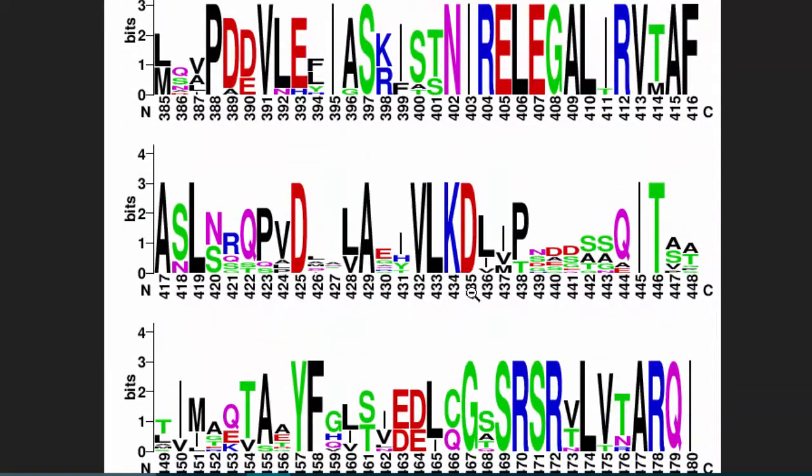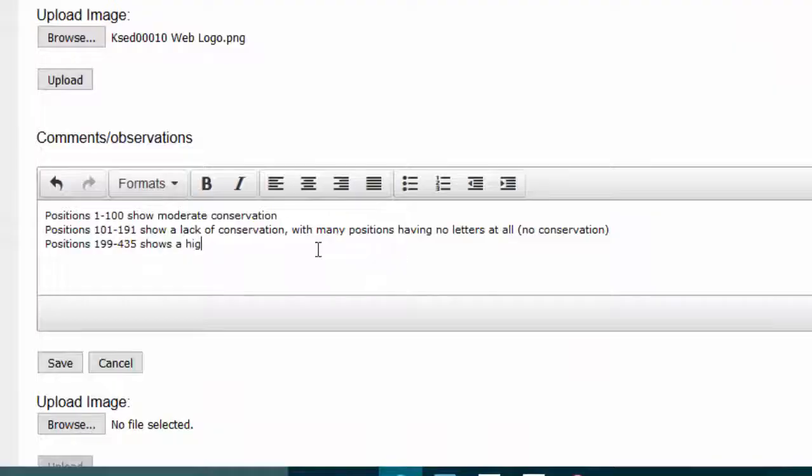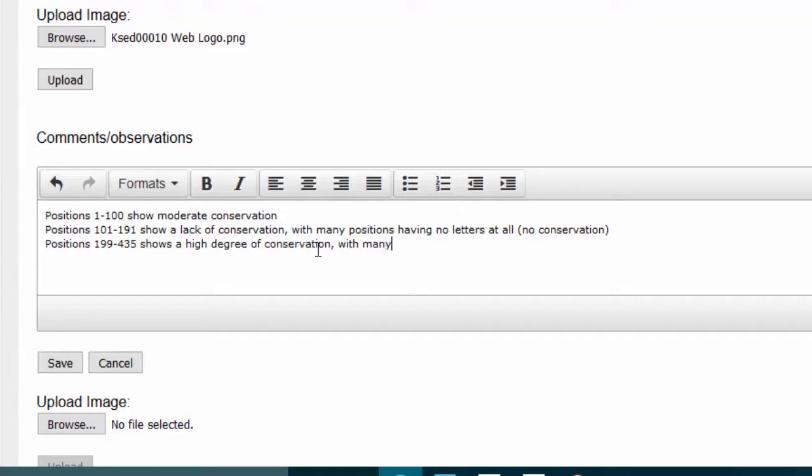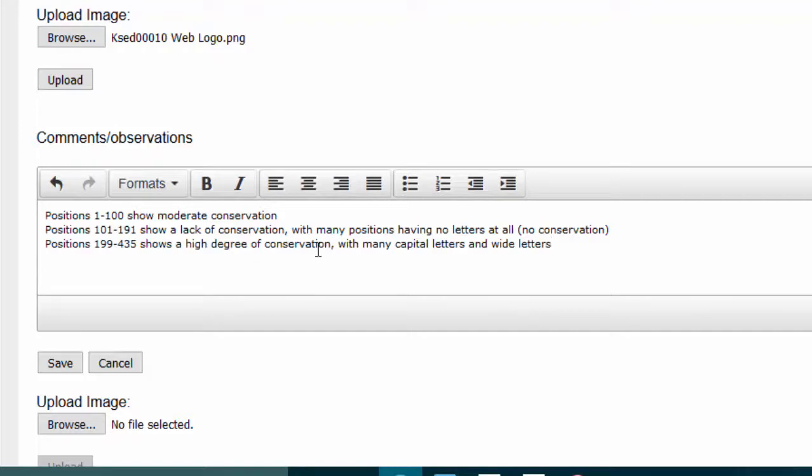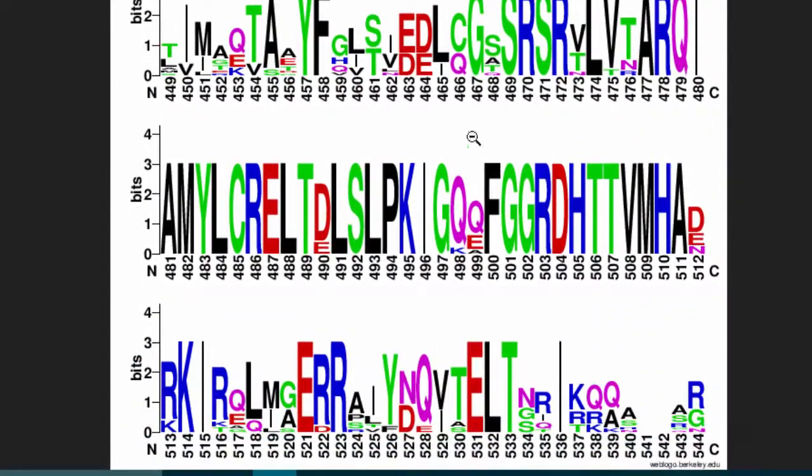Keeping going with this pattern, starting at 199 I have a stretch—199 until, I don't know, I'm going to call it 435—shows a high degree of conservation with many capital letters and wide letters, which again mean capital letters means that letter, that amino acid was there in a lot of the 11 bacteria we picked. The wide letters meaning that there were a lot of readings, so it wasn't that there was a gap there, it's that there was actually a lot of that same amino acid.